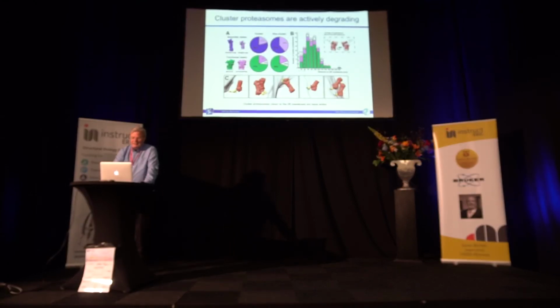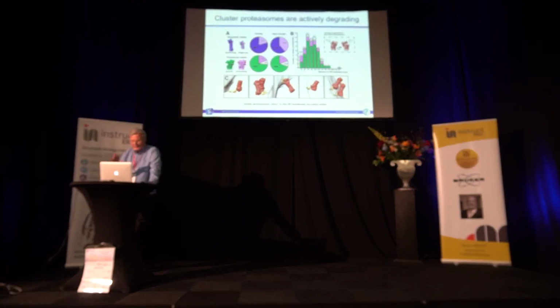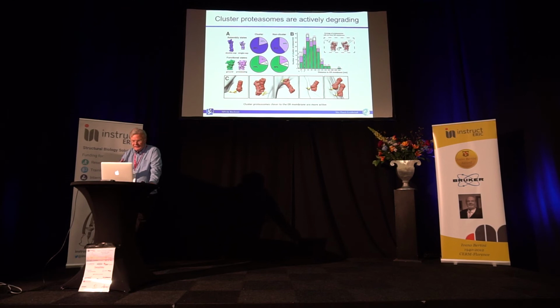We can do a somewhat deeper analysis here once again. We can look into the assembly states, we can look into functional states. Again, in green, the ground state, and in this pinkish color, the substrate processing one.